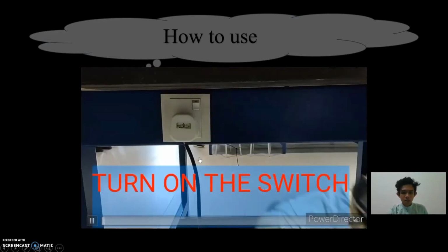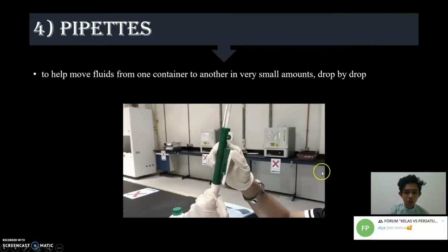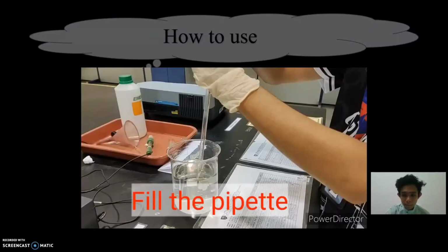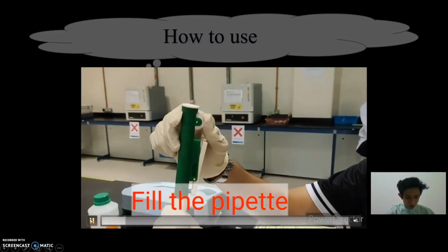Okay, and the last one is the pipette. It helps move fluid from one container to another in very small amounts, drop by drop. How to use the pipette? First, we have to fill the pipette.